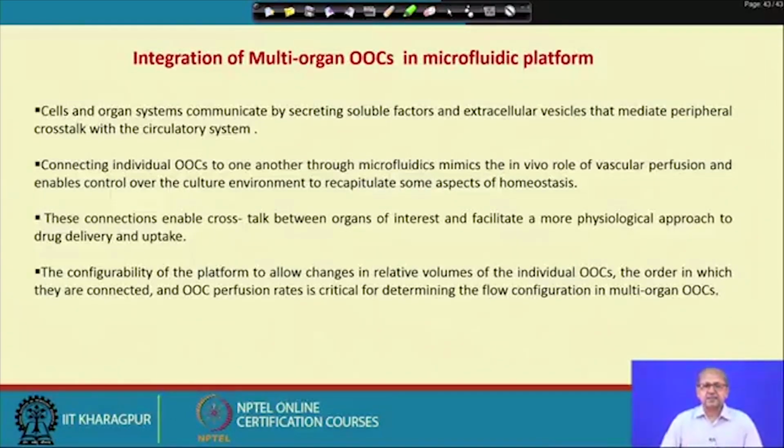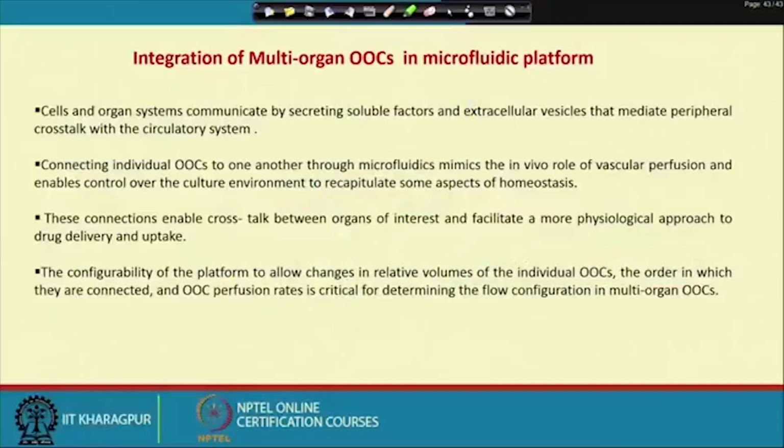And these connections, like our in vivo system, help crosstalk, and at the same time feedback control mechanisms, which is what happens in our normal physiology. Now, how will these organ on chips be integrated in different configurations, maybe parallel, serial, in one platform, or in a continuous fashion, or in perfusion ways. So, one by one we are coming.